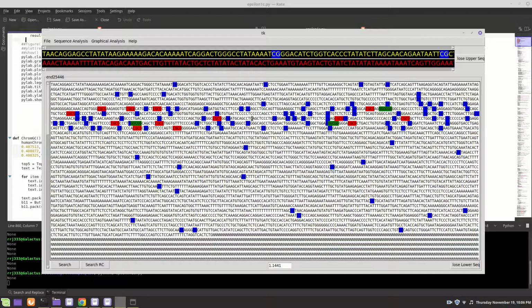And where is it? 110 from this other one? Let's see. 1,000. So we want 1,330. 1,330. Let me find that. I'm there real close.